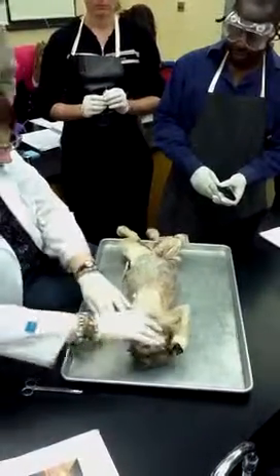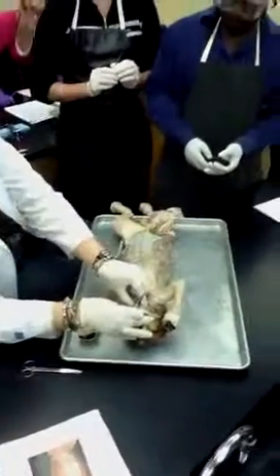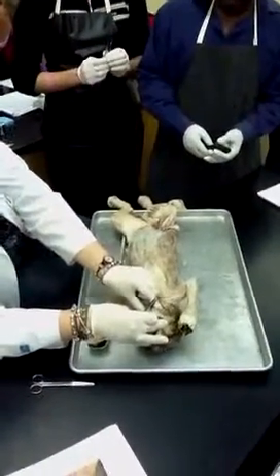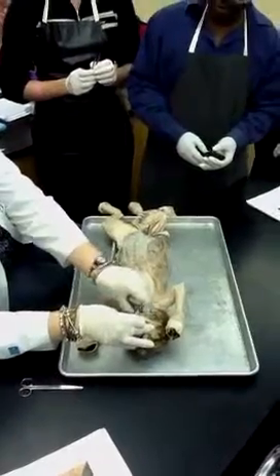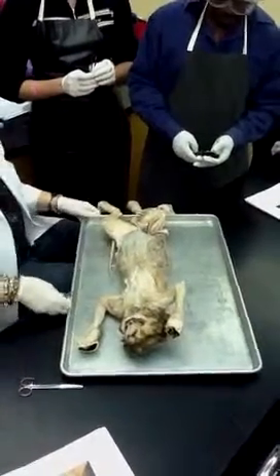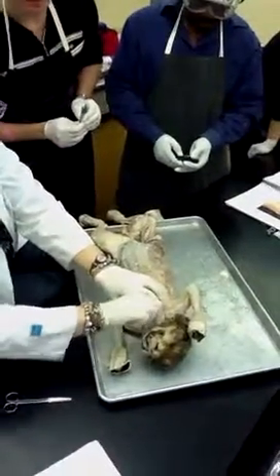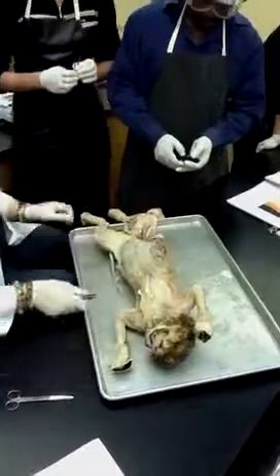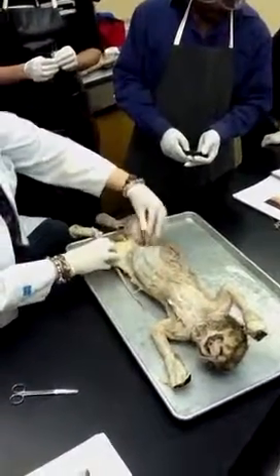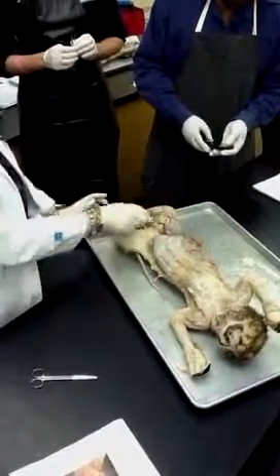We also have up in the neck, which is hard to dissect, but you're supposed to know the sternomastoid. That's the muscle that, in humans, is the sternocleidomastoid, which lets you say no. It's up here in our neck, on both sides, left and right. Then in our thigh, we have the sartorius.